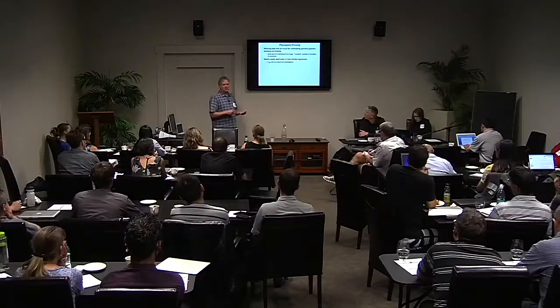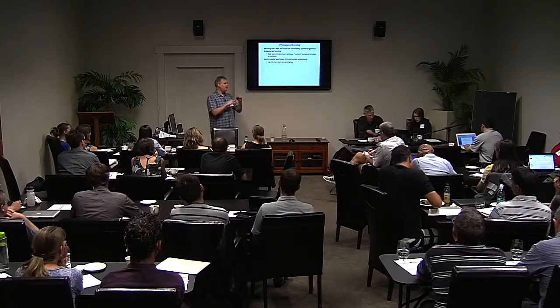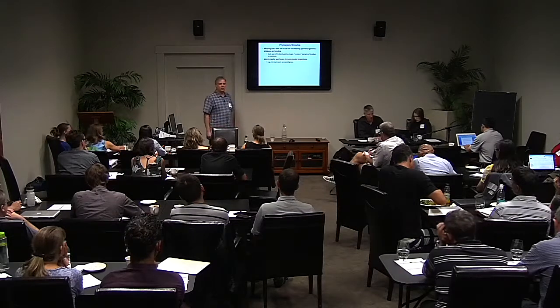then it's fine. So in TASSEL, genetic distance doesn't do that. So if both of them have N, it doesn't include that in the calculation.